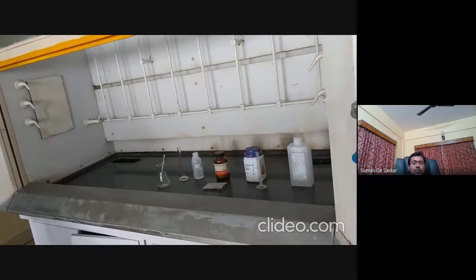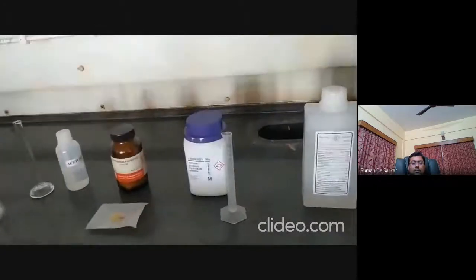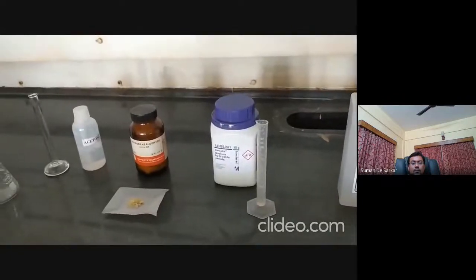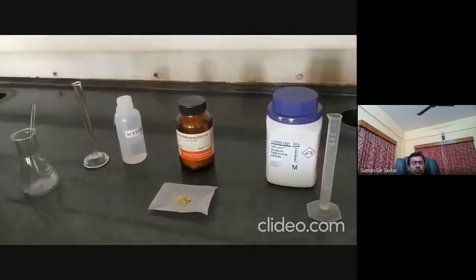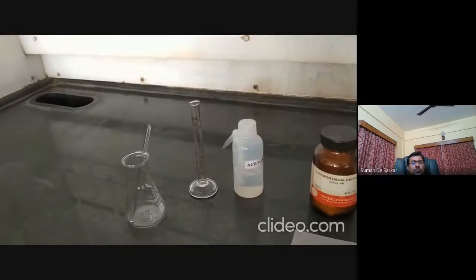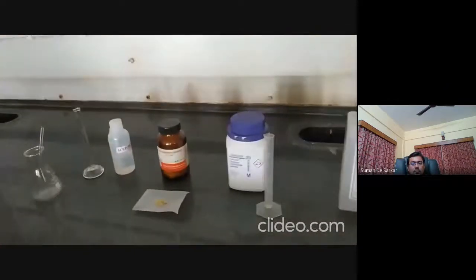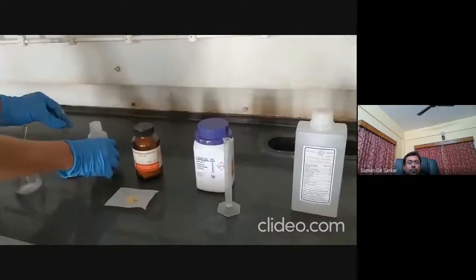For that reaction, the reagents we need are ethanol as a solvent, and then sodium hydroxide, orthonitrobenzaldehyde, and acetone. We will do the reaction inside a 100 ml conical flask. So first we will take 5 ml acetone in the conical flask.